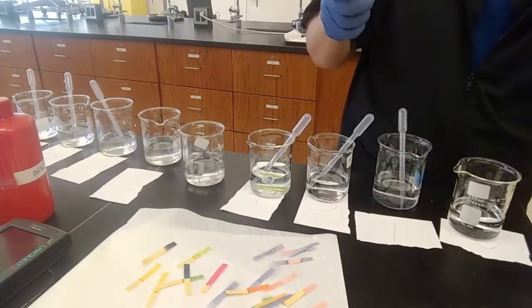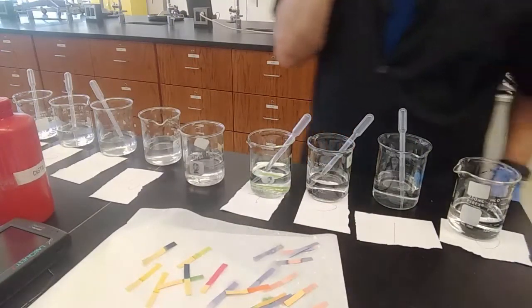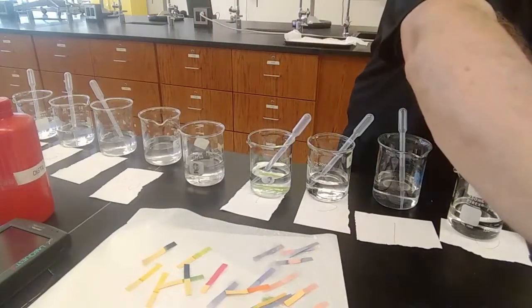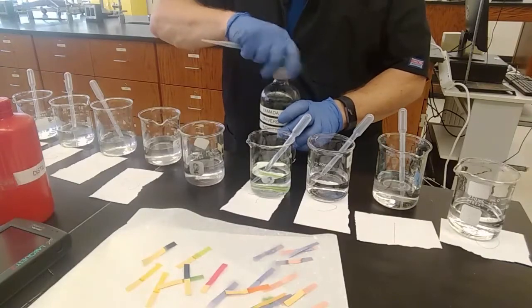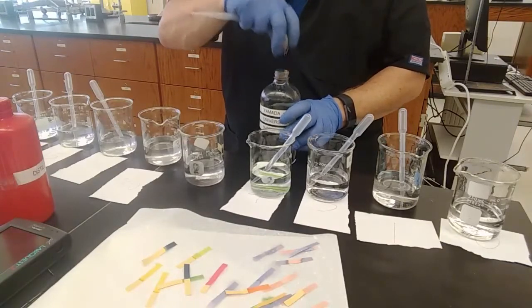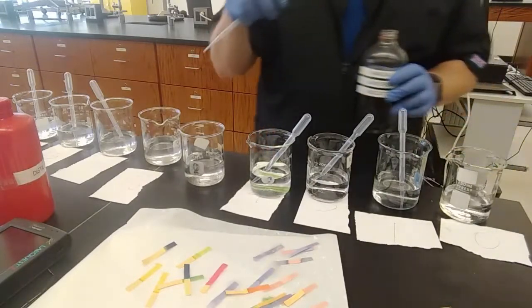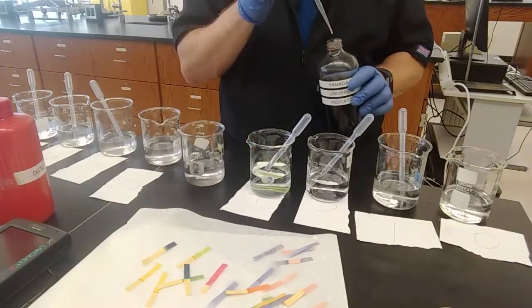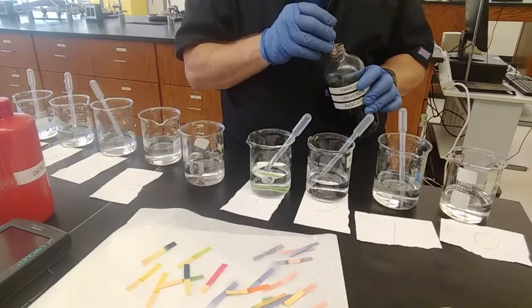For the last one, let's make it a little pretty. I'll take a new pipette, and we'll make a rainbow, because Yamada's indicator and cabbage juice indicator are kind of like what's dried onto that paper indicator, in that it reads universally from one end of the spectrum to the other.